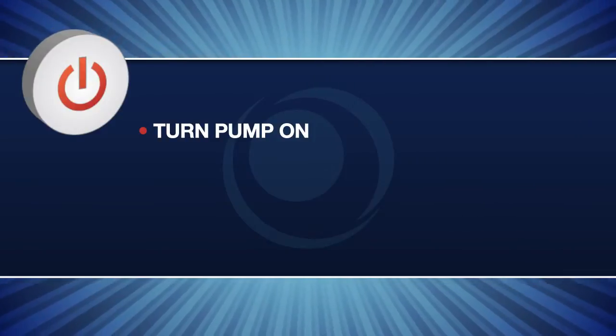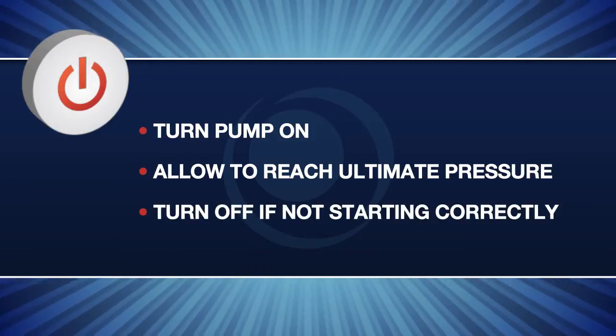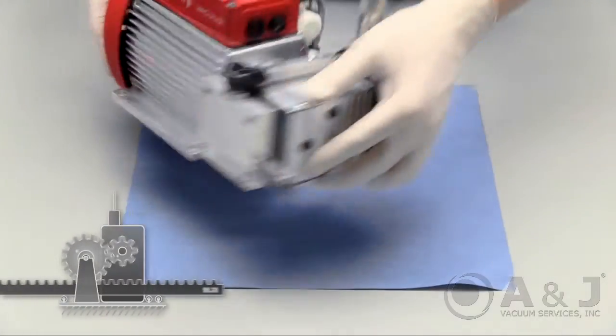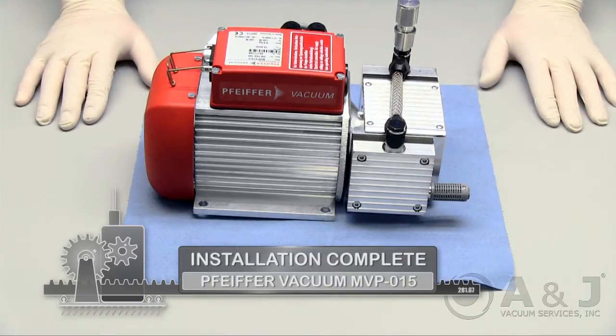Turn your pump on and test the vacuum pressure. Allow the pump to warm up and reach ultimate pressure. Do not continue to operate your pump if you notice any unusual sounds or odd behavior. You've completed the diaphragm, valve, and gasket replacement on the Pfeiffer Vacuum MVP 015 diaphragm pump.